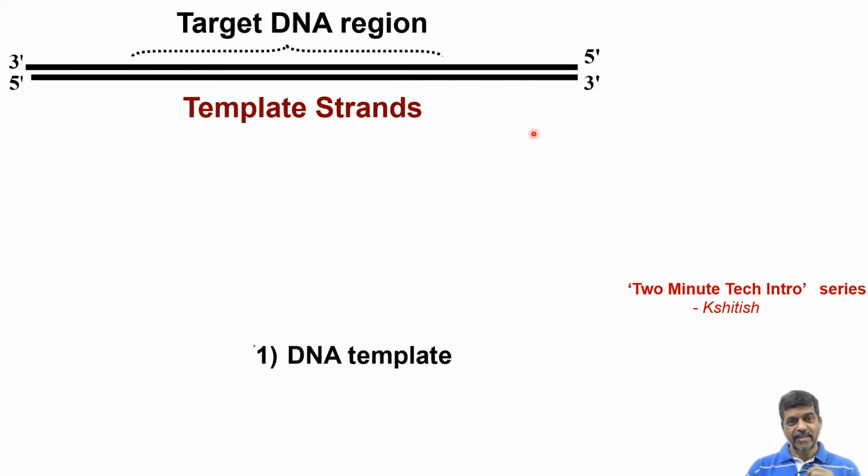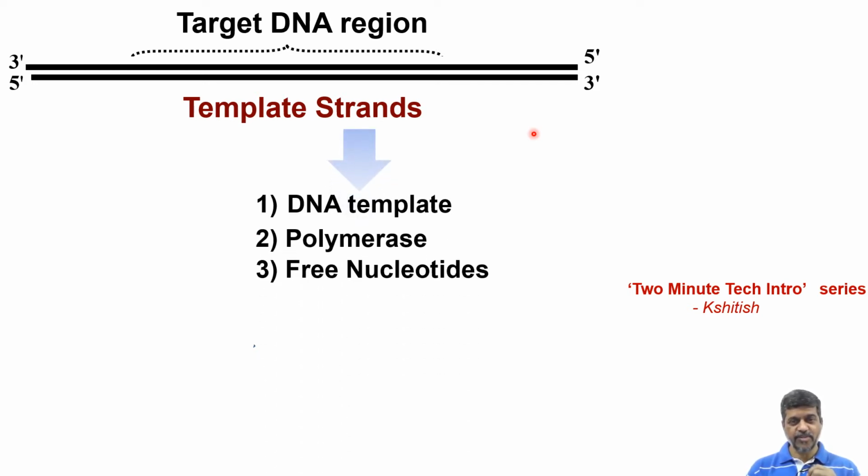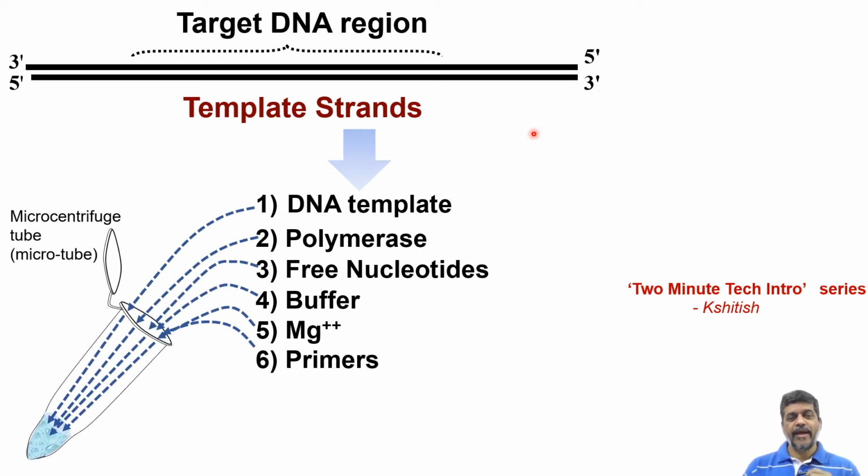So we start by adding this DNA template and a lot of other things together in a small reaction mix. And we put all of them in a tube. So the polymerase is the one enzyme that has a key role. Primers have a different key role. And of course, we do need a lot of free nucleotides and buffer, etc.